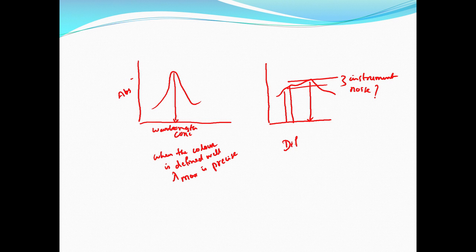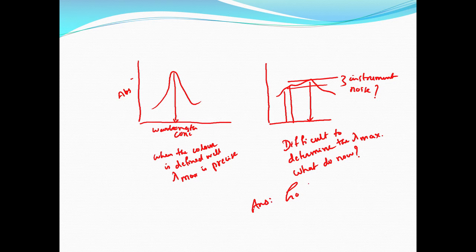Difficult to determine the lambda max. So, what to do now? Answer is, go for derivative spectrum.